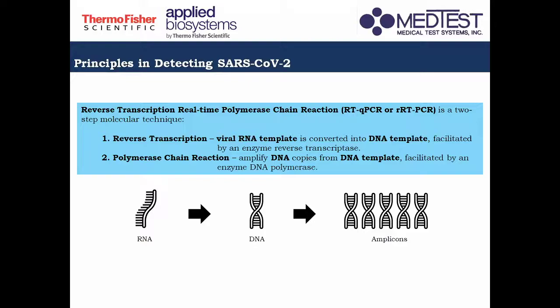Now, once we have converted RNA into DNA, the next step is the polymerase chain reaction. So basically, this technique allows us to generate multiple copies of the DNA, no, with the use of also an enzyme called the DNA polymerase.